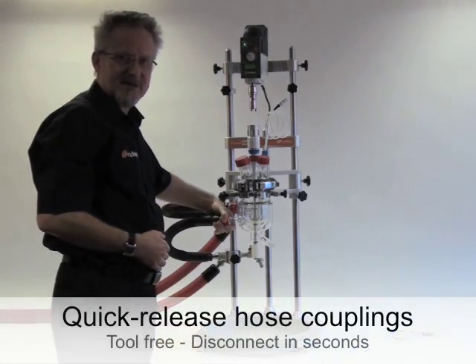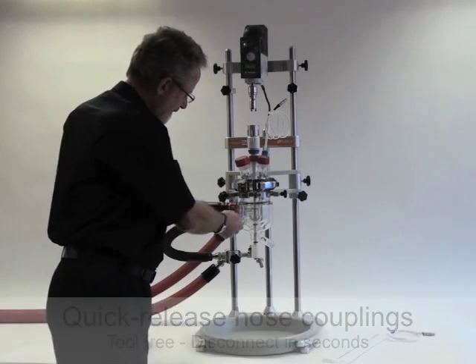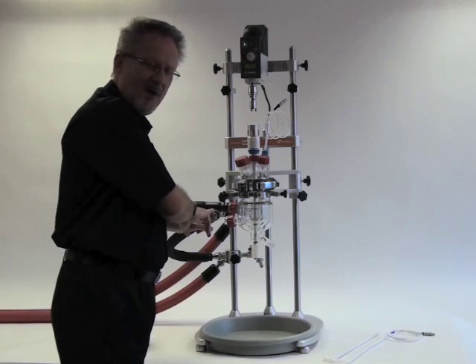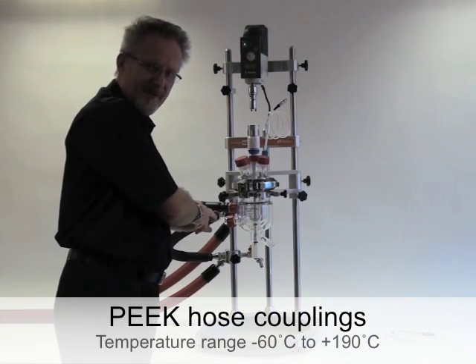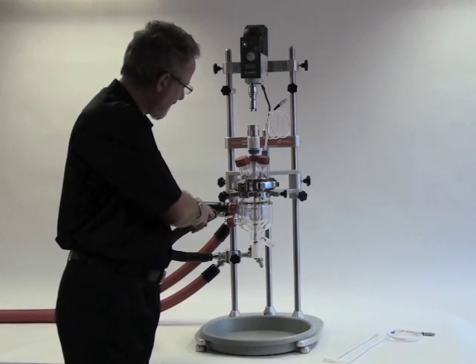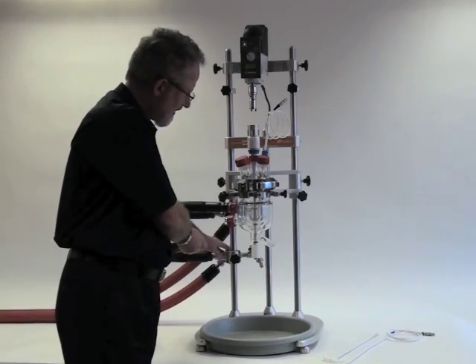Now I can remove the quick-release jacket sidearm connections. This part is made from PEEK and the seals are two VITON O-rings, one on the face of the flange and one on the side. The hoses themselves are supported from the frame, like these two manifolds.